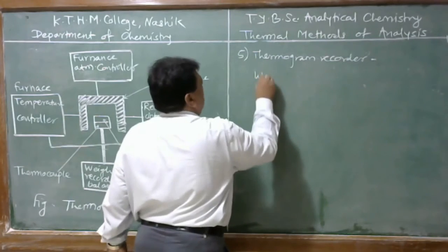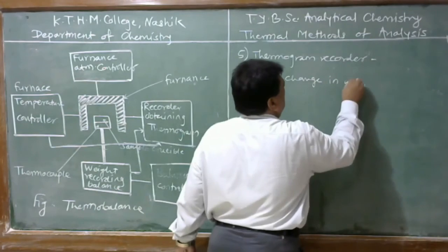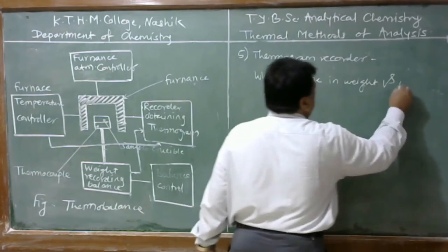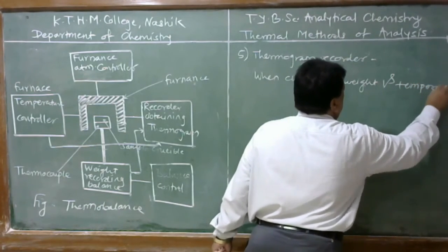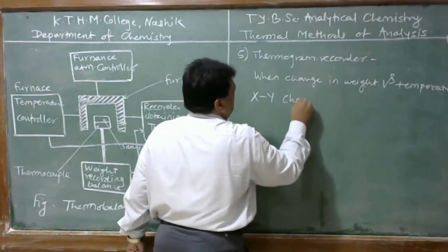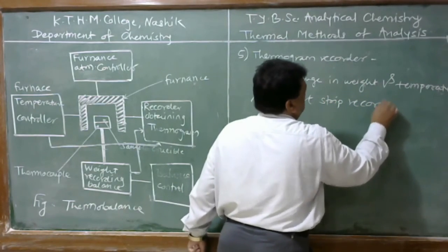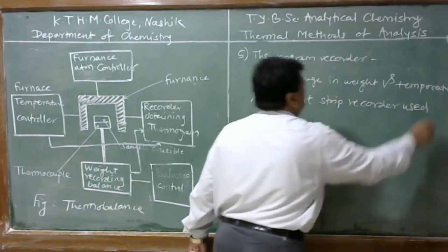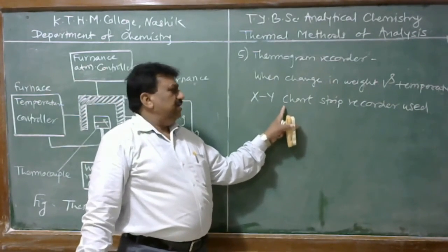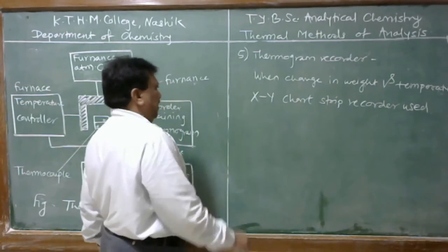When change in weight is recorded as a function of temperature, then an XY chart recorder is used.